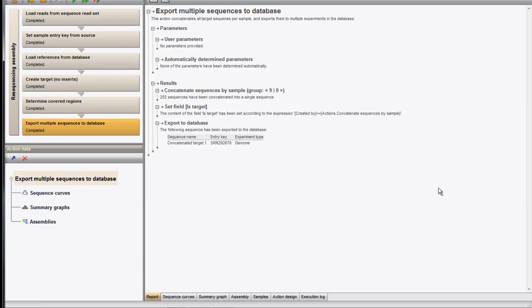Once the calculations have finished, the assembled contigs are concatenated and this concatenated sequence is saved to the database. For more detailed information, you can check our videos on the power assembly functionality.